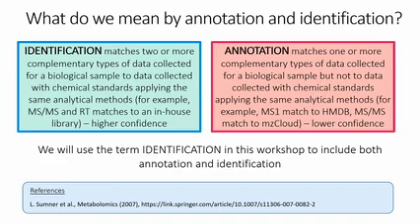So, for example, you could be using MSMS data and searching mzCloud or Metlin, etc. That's typically what we define as annotation. Actually, most of what we do in metabolomics is annotation for various reasons based on these definitions. Now, I'm just going to use the term identification during the course of this short presentation, but we're including annotation within that.